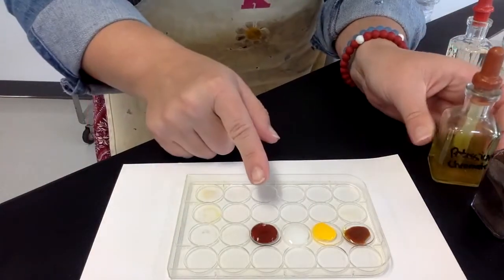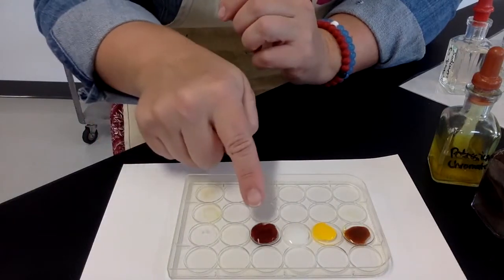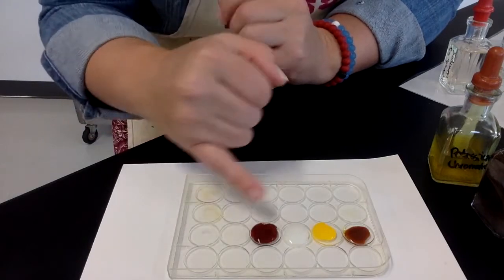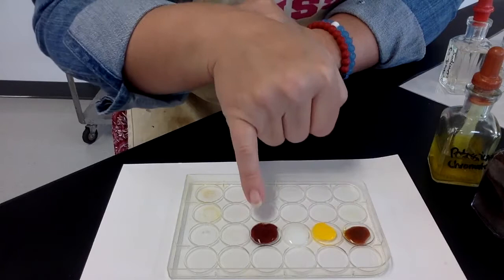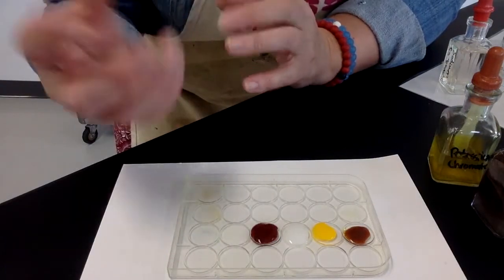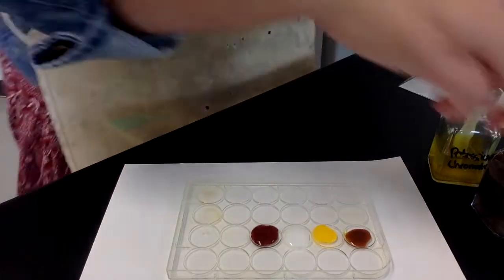Okay, so that one looks similar to this, only this one happened right away. There is no hint of yellow left behind. It's like blood or brick red almost, where this is still kind of a brownish red with a little bit of yellow on the side, but we've got this darkish, bright red, sort of like maroon almost. So that's the precipitate, the color that you see.